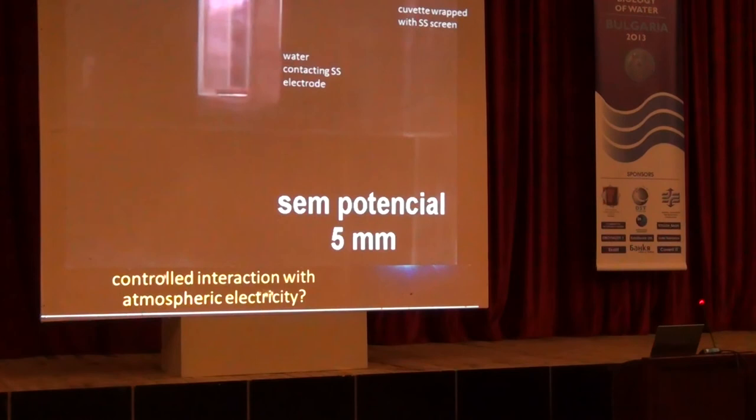And you can keep scanning this surface consecutively. You can take many scans. And then you can control the humidity. You can go at low humidity, higher humidity. What you observe is this. When you go to higher humidity, the overall surface potential decreases, both positive and negative. But when you compare the changes in potential from different pixels, you see that there is no evidence of charge transfer by any surface mechanism.